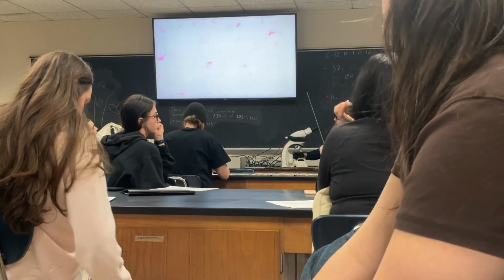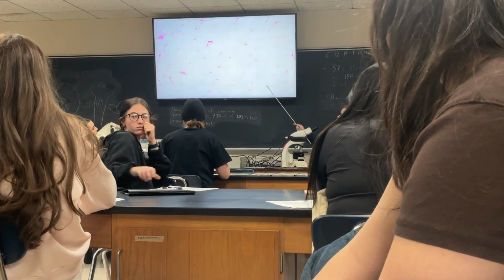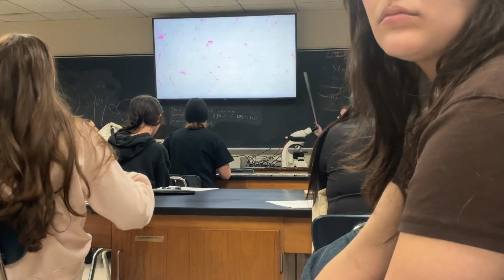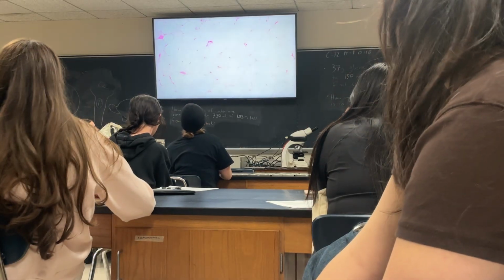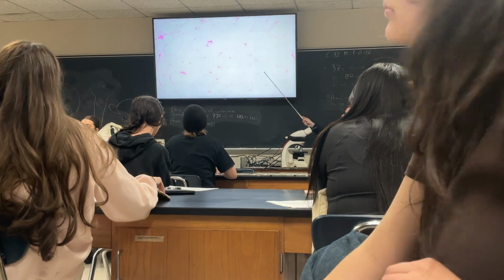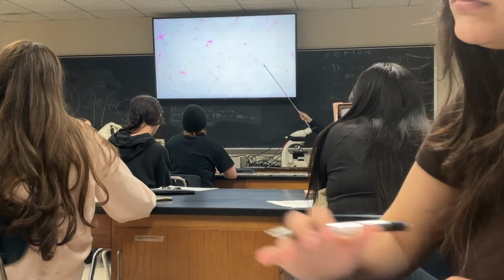Right, because these are very large cells, very round. Sometimes you'll see them kind of squished in between three other cells, but that nucleus belongs to one of those three. This is very different from lung tissue where it's simple squamous epithelium, because these lines would be a bunch of nuclei, right? These are the cytoplasmic, this is the membrane cells.